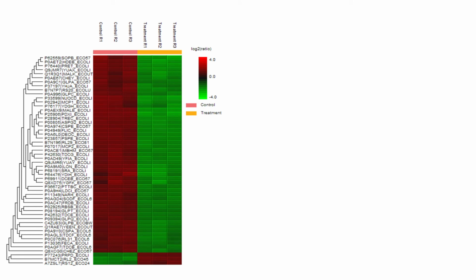Here shows the protein profile heat map generated by PEAKS Studio. And UniProt is the data resource I have used to infer biology. This heat map indicates proteins experiencing changes between controls and unknown treatments by using LC-MS label-free proteomic analysis. The level of the color represents the degree of protein upregulation and downregulation when the unknown treatments and the controls are compared.